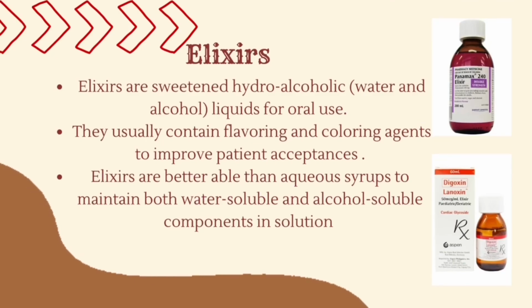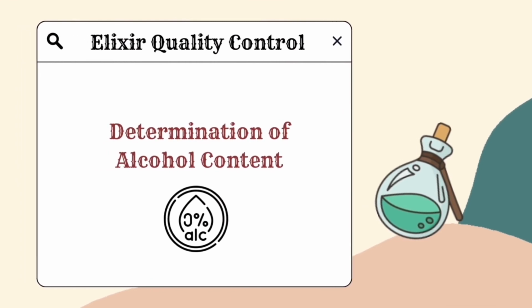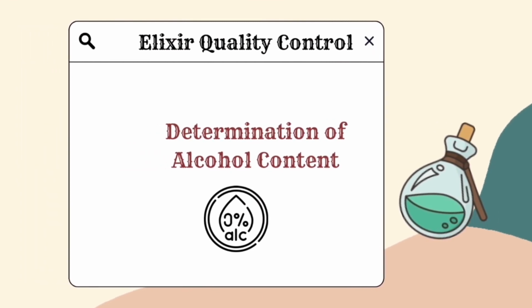Elixirs. Elixirs are sweetened hydroalcoholic liquids for oral use. They usually contain flavoring and coloring agents to improve patient acceptance. Elixirs are better able than aqueous syrups to maintain both water-soluble and alcohol-soluble components in solution. Elixir quality control: determination of alcohol content.